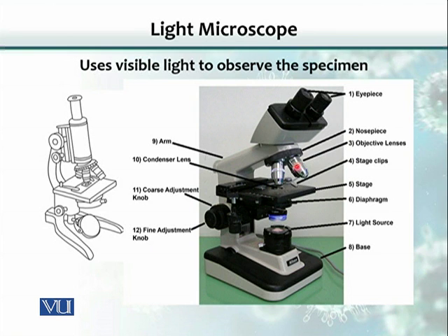This part is the objective lens. There are three or four different lenses with different powers of magnification. This part is called the eyepiece, and here is a knob for focusing the image.